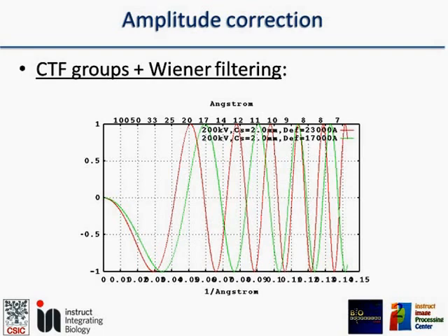Okay? So these coefficients here have been multiplied by a very low number, and in your 3D reconstruction will be damped, and so you have to boost them up to recover the original size of those coefficients. And for this boosting up, what is normally done is to calculate CTF groups. So for instance, these two CTFs may be put into different groups, so that you put all the micrographs that have a CTF, or the focus, that is close to this red one.